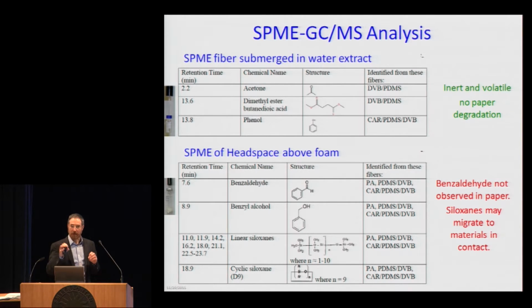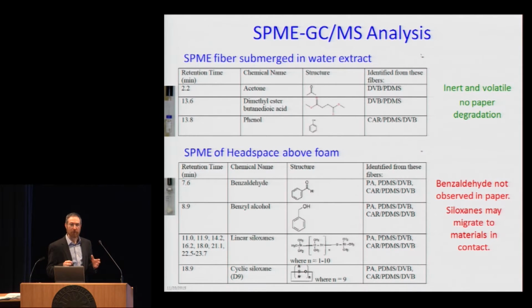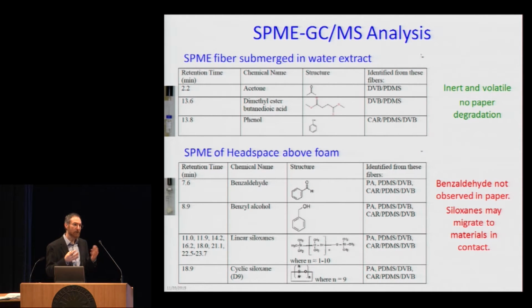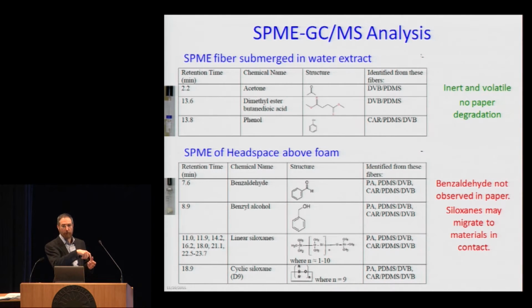And so in our case, this is where looking case by case kind of matters. We were interested in storing for very long term. We had just bought 5,000 special cases for storing wax cylinders, these things that hold recorded sound. And they wanted a piece of foam that those could lay on to keep them from hitting the very hard material that they had chosen for this container. And so this foam was going to be in direct contact with the wax cylinder. And in that case, we have a lot of stuff that's going to migrate into the wax cylinder and maybe onto the wax cylinder. And because it's not reactive, you won't see a change in maybe the hydrocarbon lengths of the wax or things like that. But you might change the glass transition temperature or the softness of that surface. And here you have an object where you need to rub a big metal ball through a groove on that surface to play it and get the information out of it, otherwise it's fairly useless.